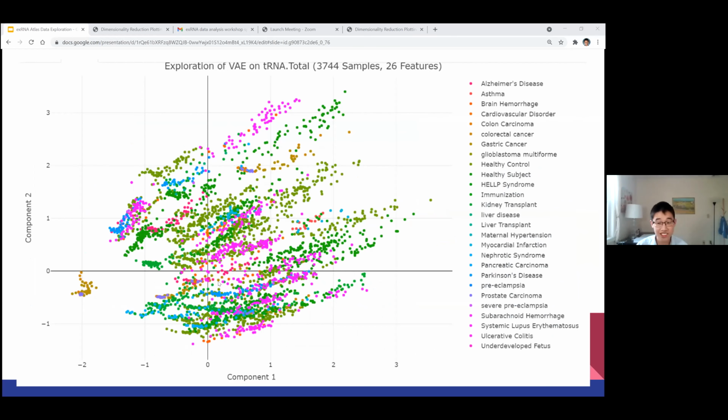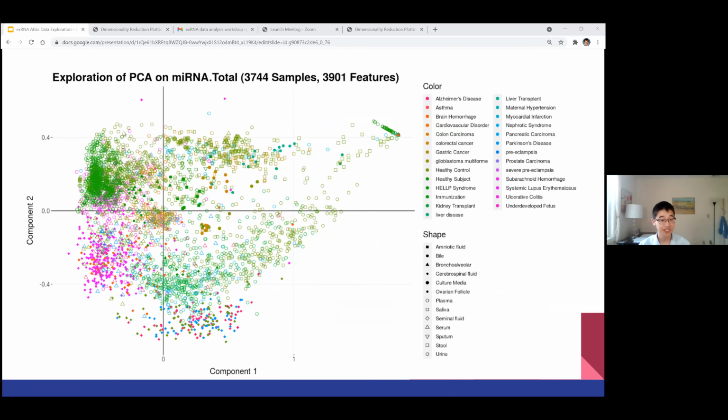That's a good question. A good thing about principal component analysis is that you can add new samples to existing reductions. So for example, this is just speculation, but if I were to take a biosample from a patient, sequence it, and then place it on an existing reduction, if that patient were to appear with all the other carcinoma samples, that might be indicative.